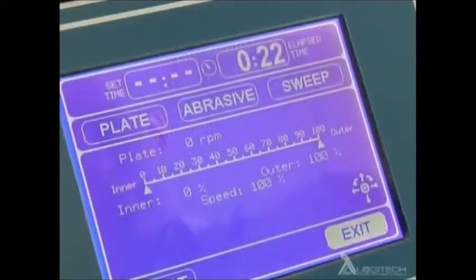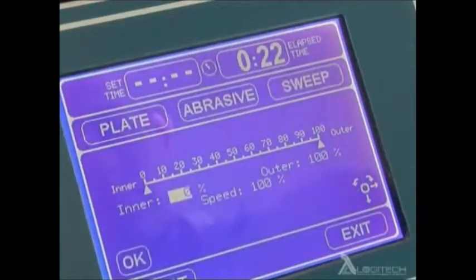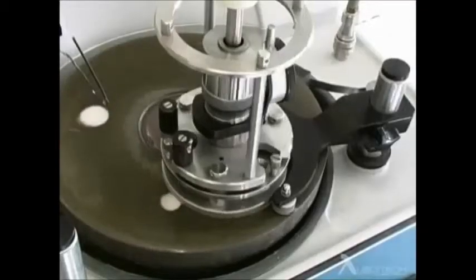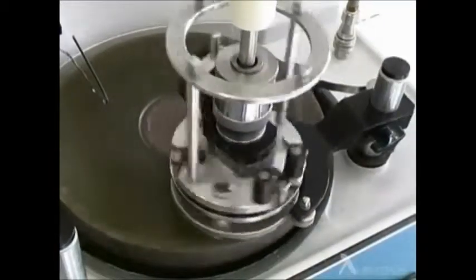For some polishing operations, it is desirable for the specimen to move across the plate. This eccentric sweep is controlled via the joystick. For optimum results, the speed of movement and the amplitude of the sweep movement can be precisely controlled, allowing the exact repeatability of sweep parameters and leading to results of greater consistency.